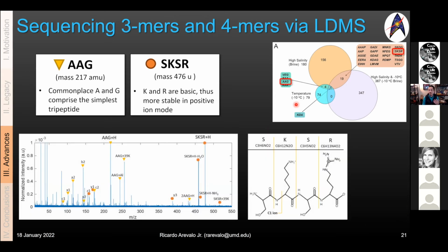And so here's the single spectrum I'm going to give you because this is so new, cutting edge, and for us. But the takeaway is that we're able to see the molecular ion of both of these. This is a combination, right, of both of these. And we're able to see a variety of fragments without, the cool part, without applying a matrix to the sample.